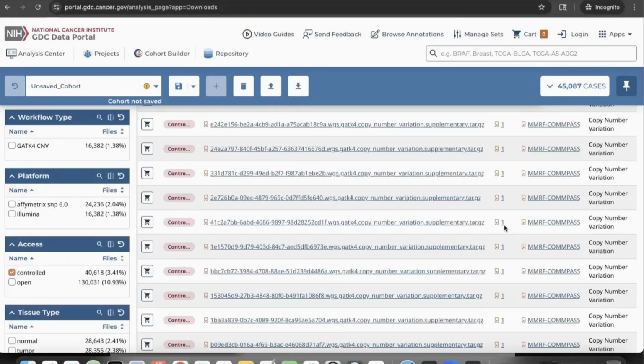All right, thanks, Shin. Let me look through the questions real quick just to make sure I didn't forget any. I think there is a question asking which one is better, segment mean or absolute segment value. I think segment mean is definitely an option, but I personally prefer using the absolute integer values. However, there are two caveats. First, if you're using some old tools, for example GISTIC to derive frequent copy number change areas in a cohort, it's only compatible with the segment means.